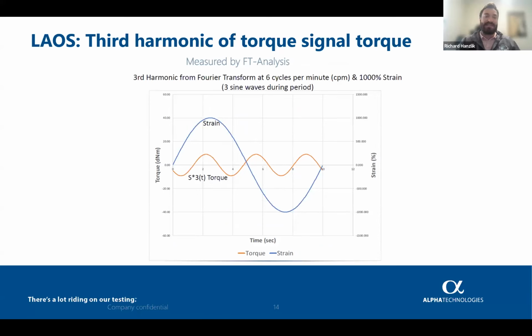However, when we start to break down into this harmonic analysis, we see here the third harmonic, and this is the one that occurs after the first. We don't see the distortion in each individual harmonic. It's when we put them all together that we can see that distortion.